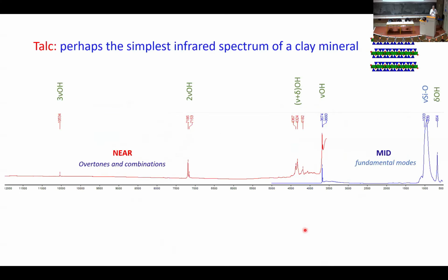Okay, now, with this background, we can understand a little more about this plot. This plot is the full spectrum of talc, starting from the mid-infrared on the right, and the frequency is increasing towards the left. Don't ask me why the frequency is going up when we go left. It's a traditional vibration spectroscopy, and we keep the traditions. So, this is the mid-infrared up to 4,000 wave numbers. And that's the near-infrared. The red is the near-infrared. It's a continuous spectrum, but it is acquired by two different spectrometers in a different optical configuration. That's why they don't seem to match exactly.